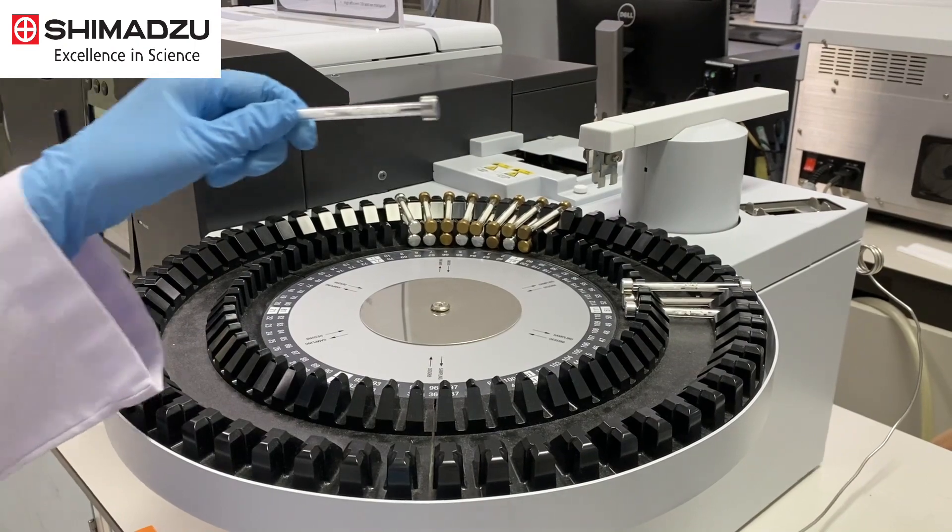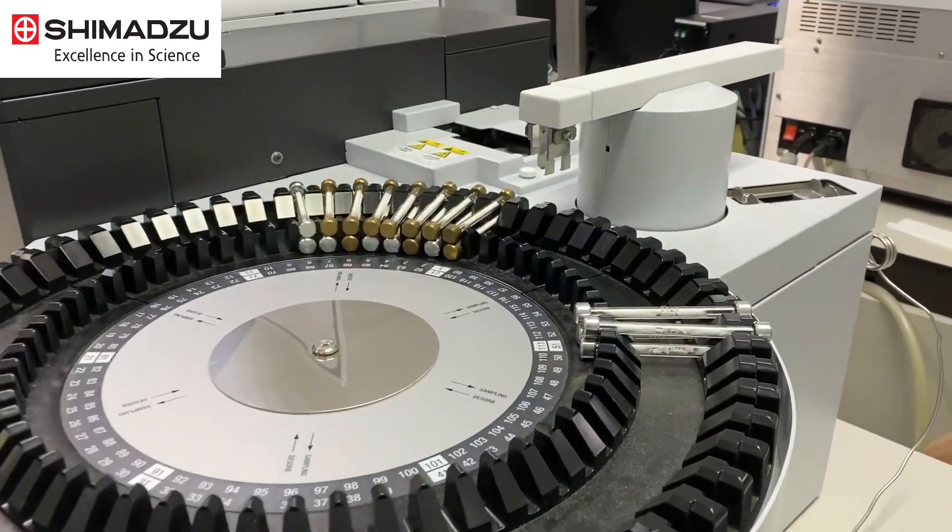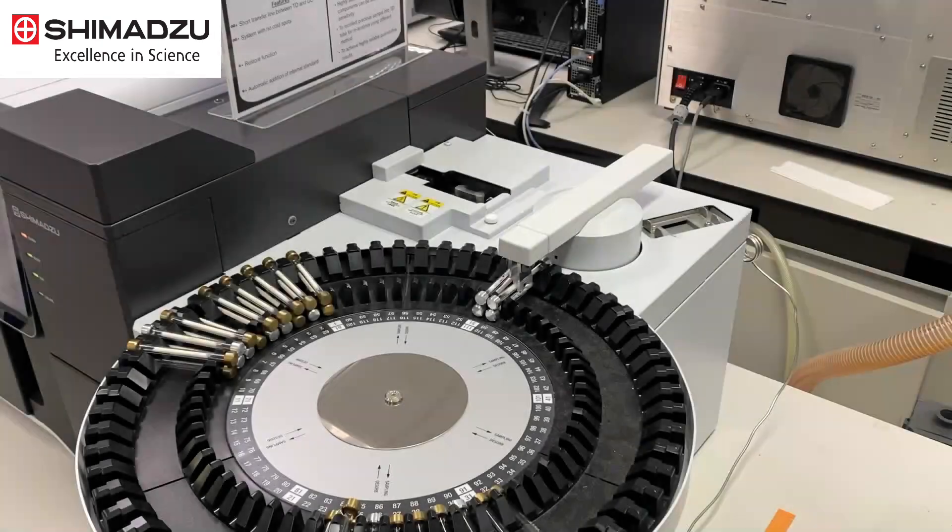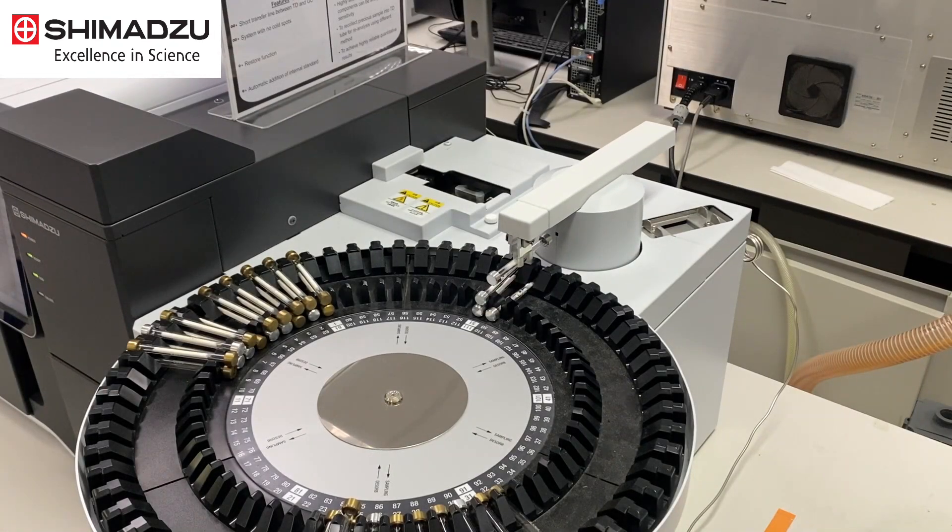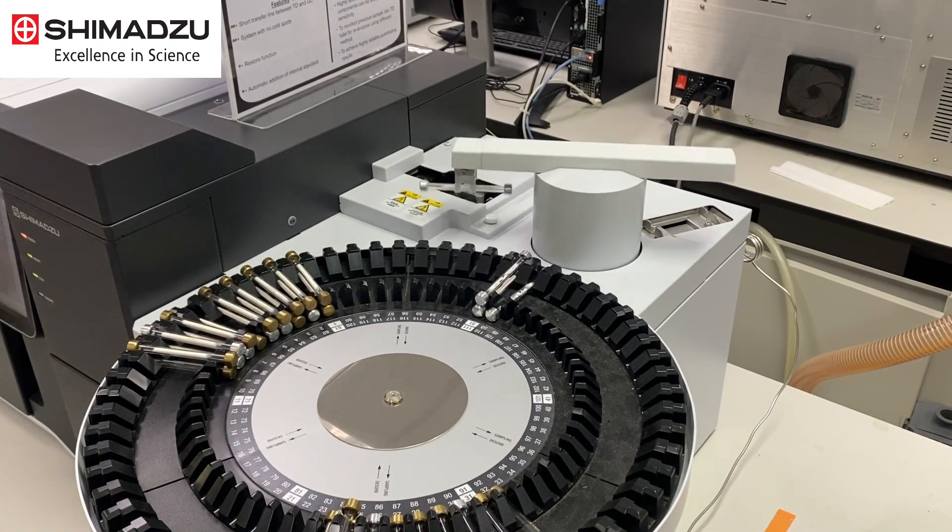The filled TD sample tube was placed on the tray of the thermal desorption system. The auto-sampler arm transferred the TD tube to the heater.